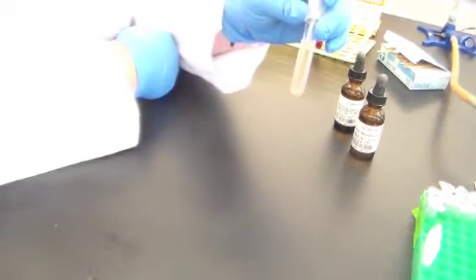This is obviously not my morning. Well, it's slowly coming up. So you'll let this sit for about 15 or 20 minutes, but you can already kind of see a red color developing in here. What this means is that there was still nitrate present in that media that's now being reduced to nitrites by the presence of the zinc ions.